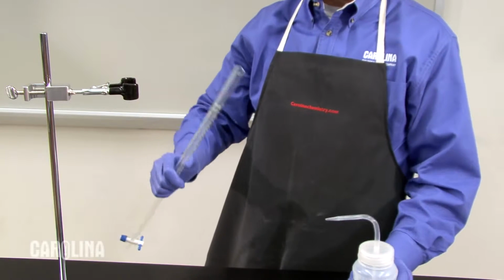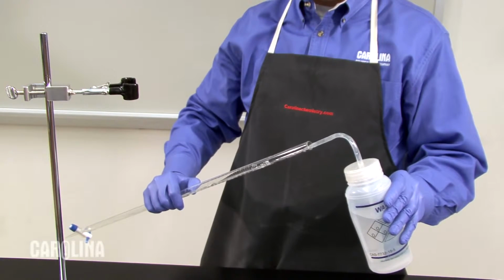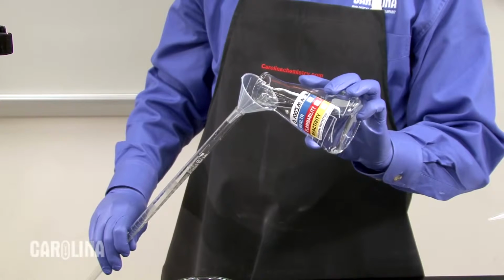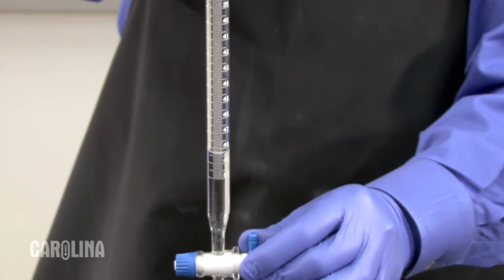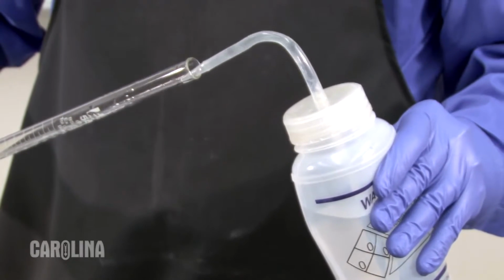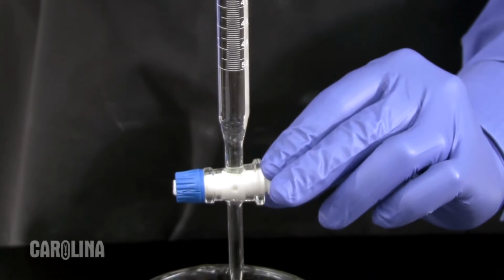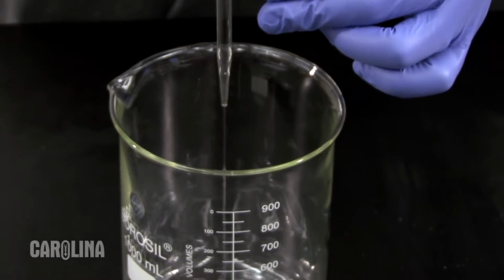To prepare your burette for the titration, it is good laboratory practice to rinse your burette thoroughly with deionized water, then with a small amount of titrant. After each rinse, open the stopcock to allow the liquid to drain out the bottom. If there is a lot of liquid clinging to the walls of the burette, then thoroughly clean your burette and repeat the rinse process. The accuracy of this technique is dependent on the titrant flowing into the flask and not sticking to the walls of the burette.